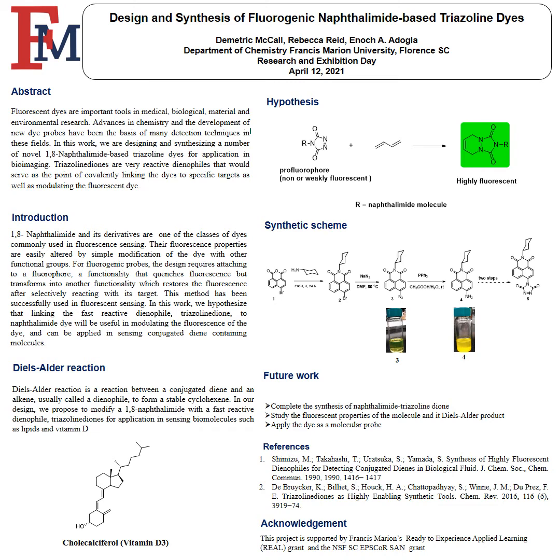So for this research, I've collaborated with Rebecca Reid and Dr. Adogla. The basis of our research is to design and synthesize fluorogenic naphthalimide-based triazoline dyes. It's a mouthful, so that's in the title. I will briefly read over the abstract and introduction, then I will discuss some of the chemistry and important applications of this synthesis.